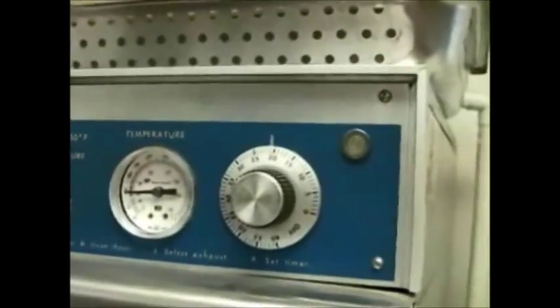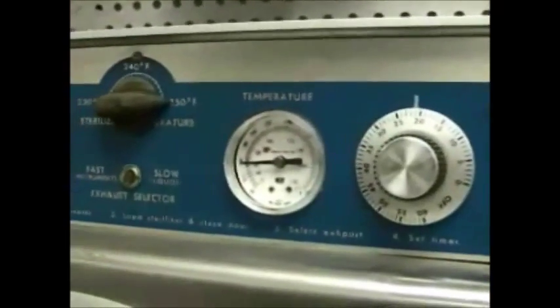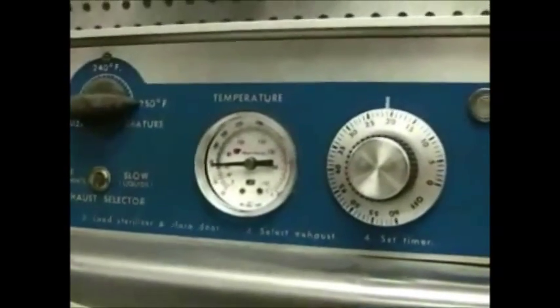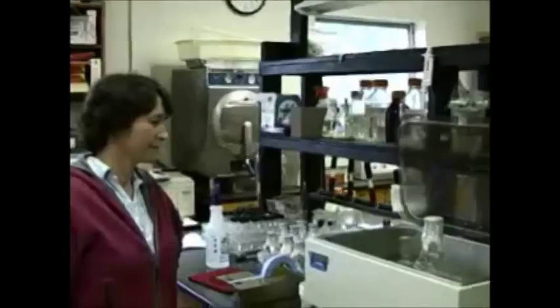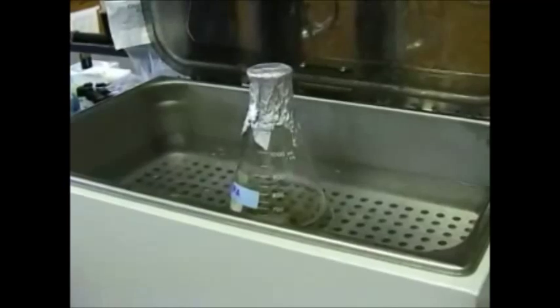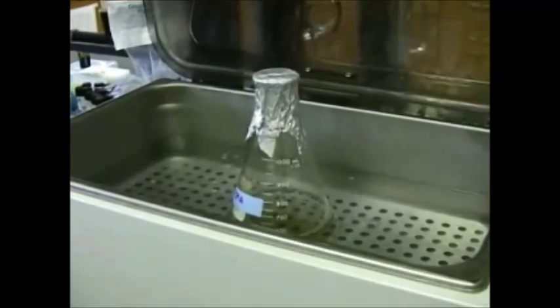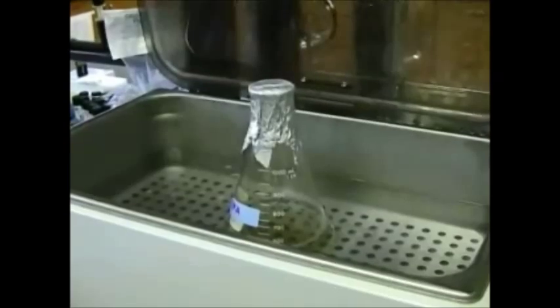It's set for about 20 minutes. The timer is going to start when the temperature gets up to 121 degrees centigrade. Once the agar has come out of the autoclave, we put it into a constant temperature water bath at about 50 degrees. This is because that agar is so hot that it is, in some cases, superheated. So you want it to cool down to around 50°C before you pour your plates.